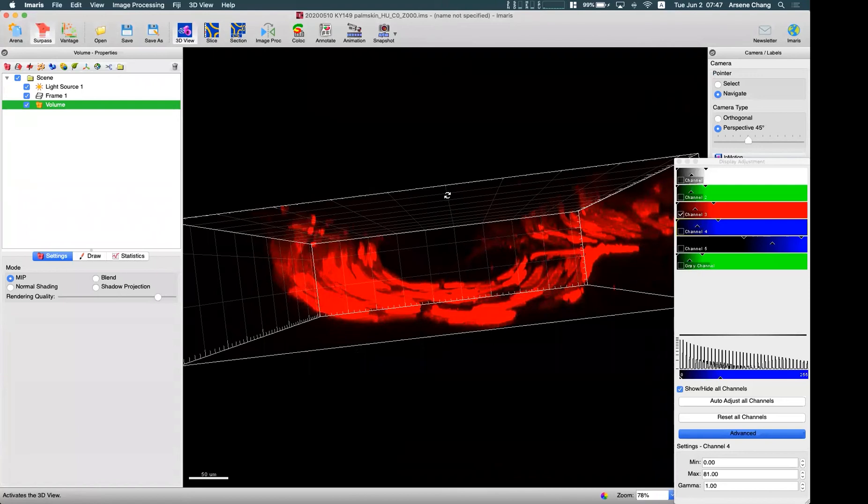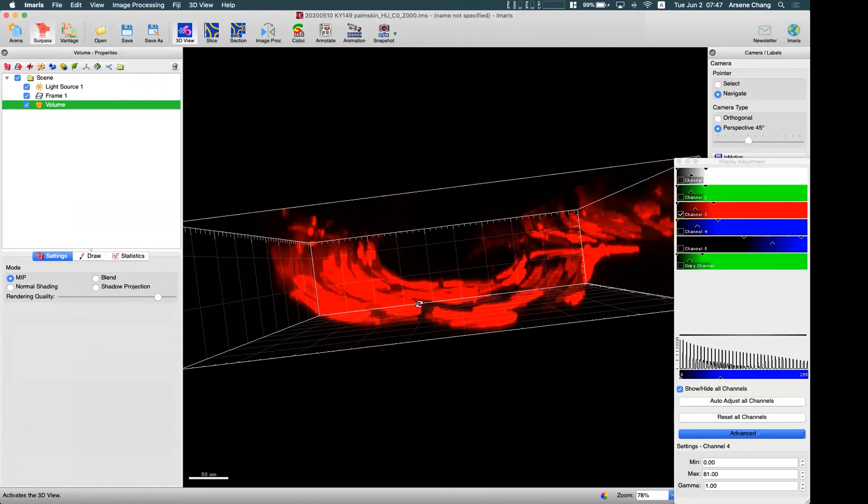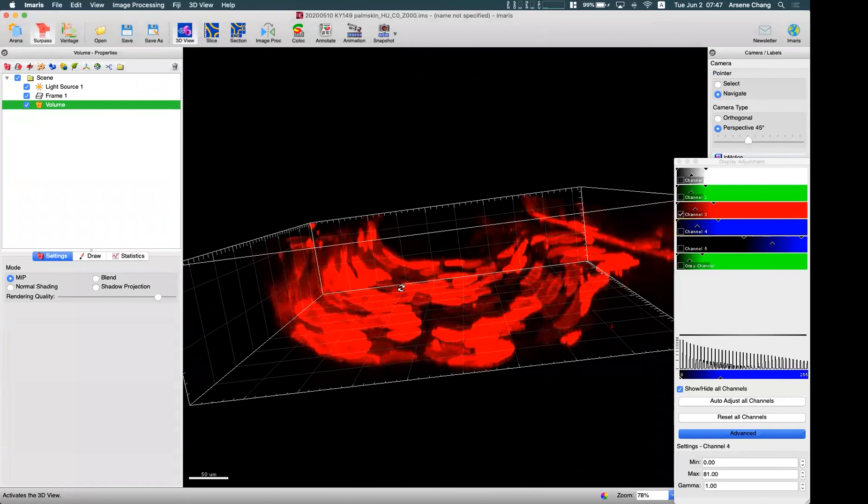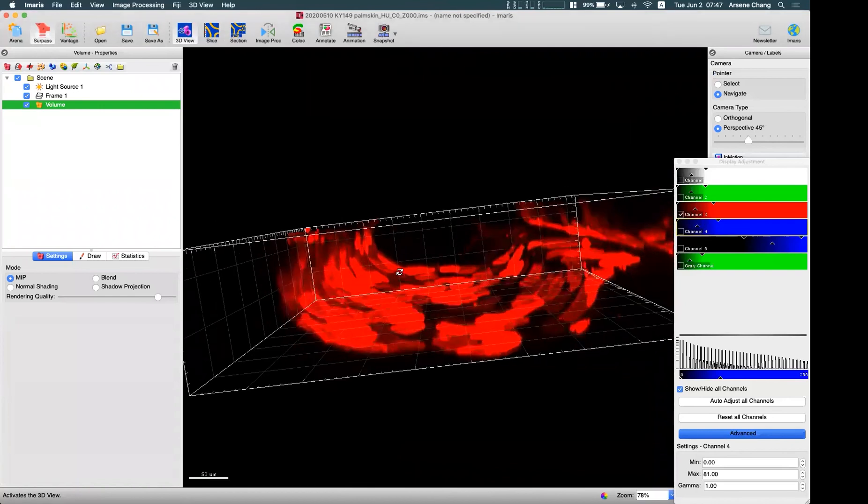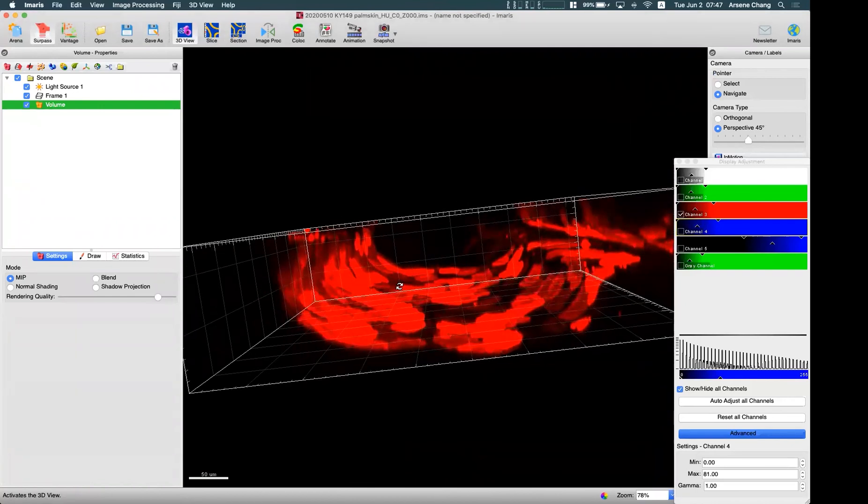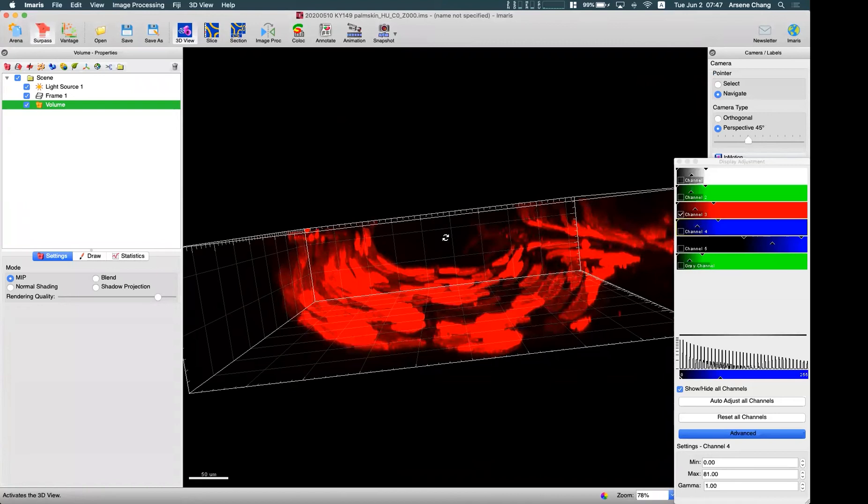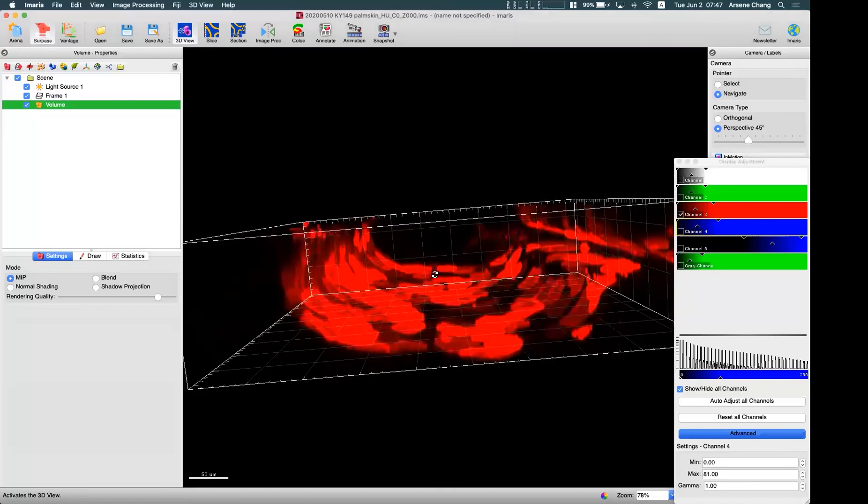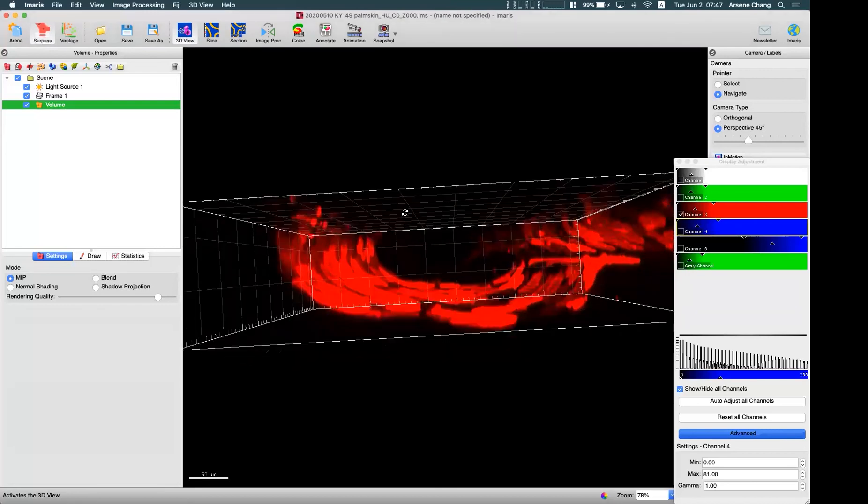Because if there is no closing, Imaris will think this is all the open space and try to fill this space with the cell detection. So the whole volume will look like the whole cylinder shape, which is not the real volume of your cells.